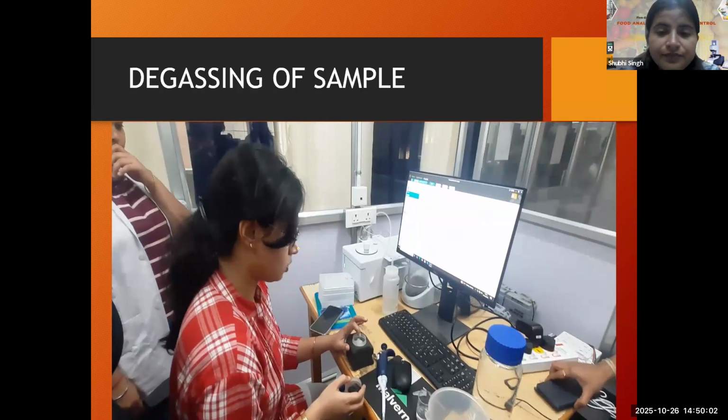Now there is a demonstration of the DSC instrument which is available in our central research facility. So you can see the machine over here, and then there is a computer which is giving the results.